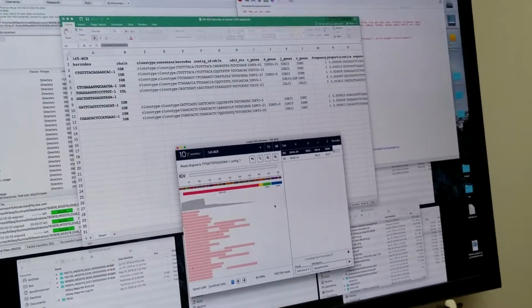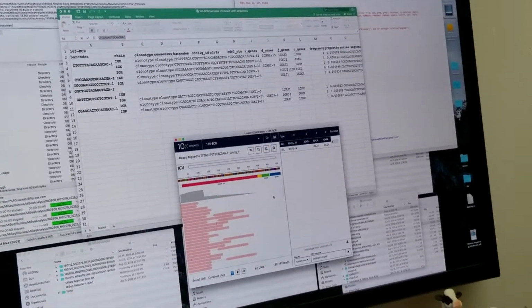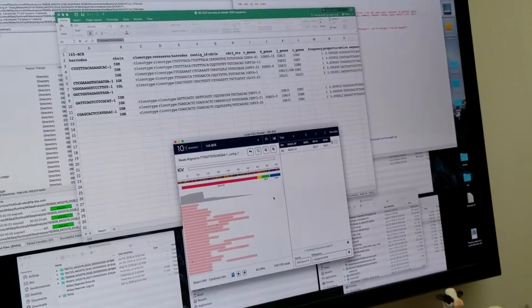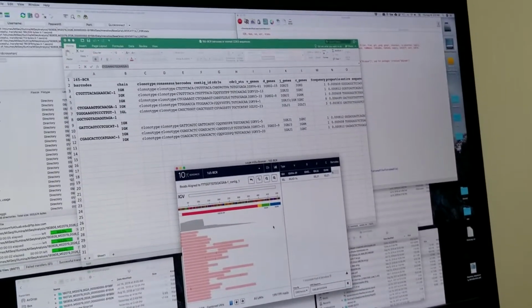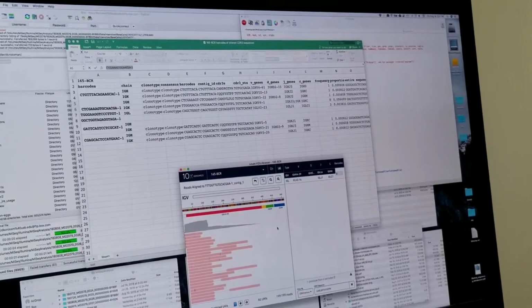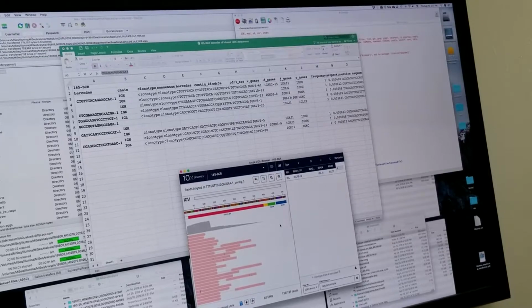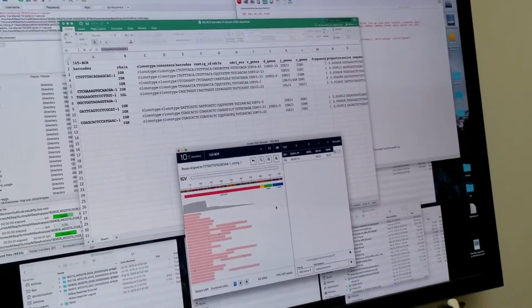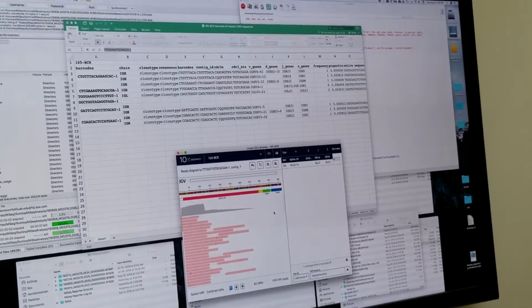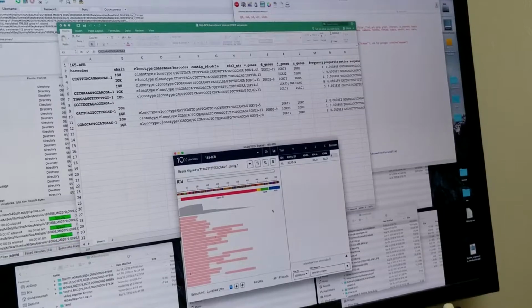But now it's obvious that this approach is going to bias reads towards the 5' end, which is not exactly what we're interested in, and then we're going to piece it together, like the guy explained a long time ago. But it's not going to have many representatives from the VDJ or the CDR3 region because it's too far down. But shouldn't it? Because that's the way they design their kit, that you can see the CDR3 region.